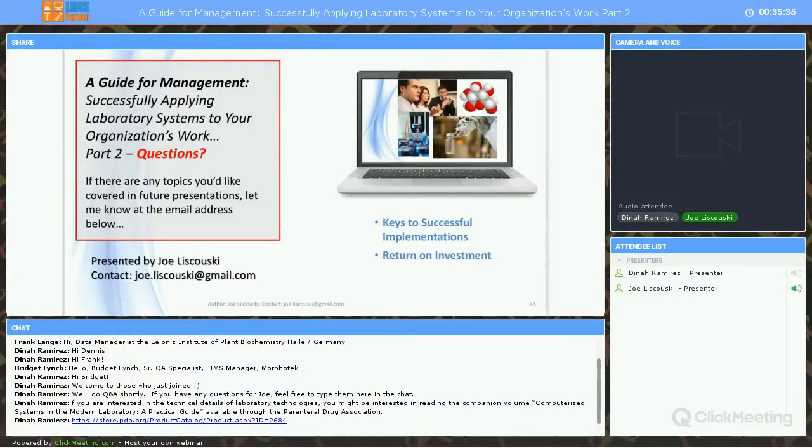One of the problems that's come up, or actually it's been a problem for a long time, is that laboratories have been viewed as kind of a side issue when it comes to information management and technology management. IT or information technology groups will build large databases of customers, for example, or products.